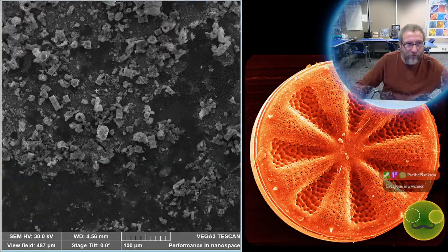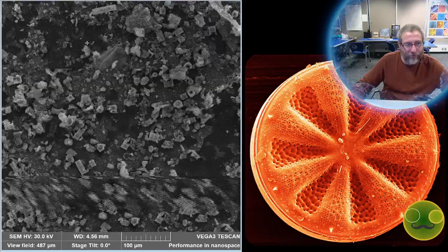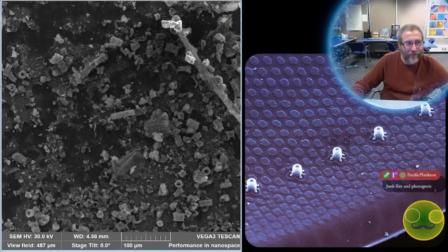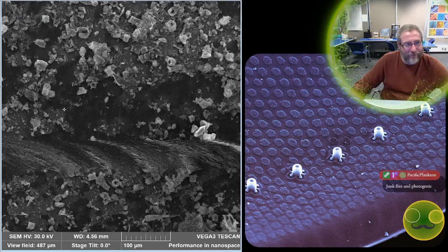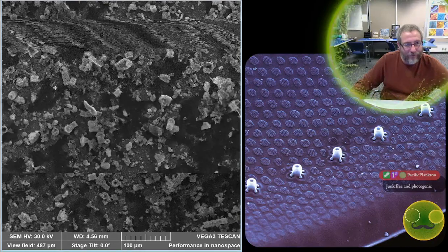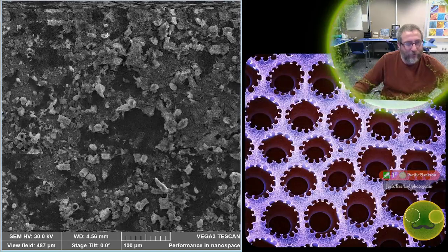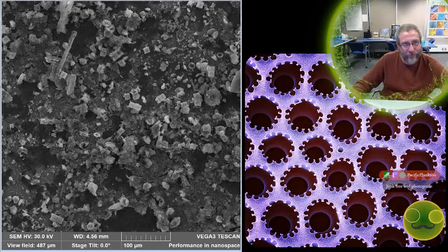That's probably the eternal quest of the person who's controlling the SEM, trying to find something that you're pretty sure must exist in your sample, but you need to basically search around until you can find it. And in my case, I have you guys along as company while we do it. So that's nice. And we can both look around. I guess I'm doing most of the looking, seeing how you don't have any controls. But you're here with me, and that's nice. Nice to be able to share some work.